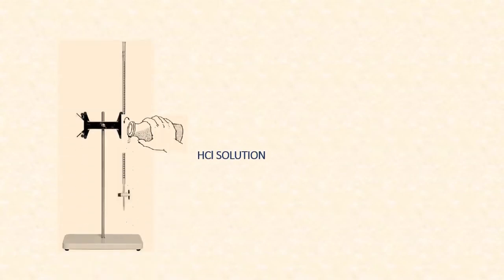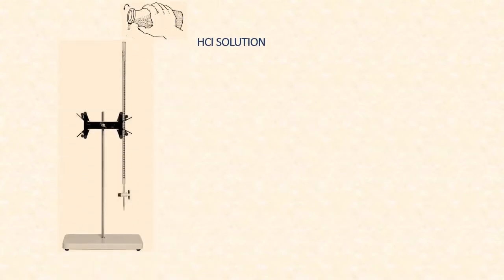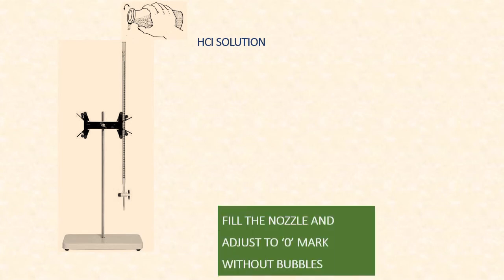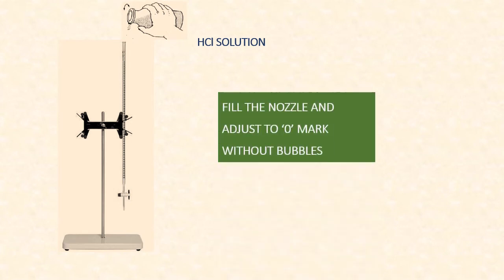Fill the burette with HCl solution, fill the nozzle, and adjust to zero mark without bubbles.